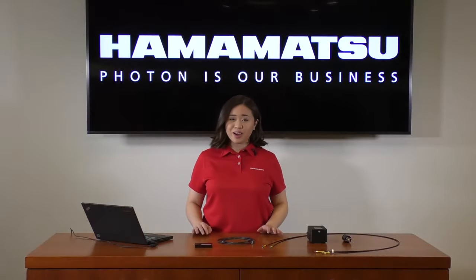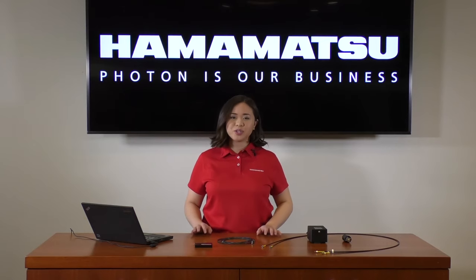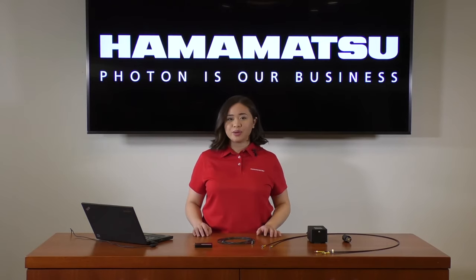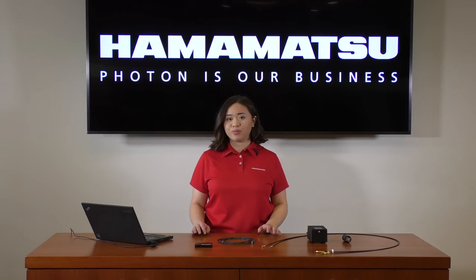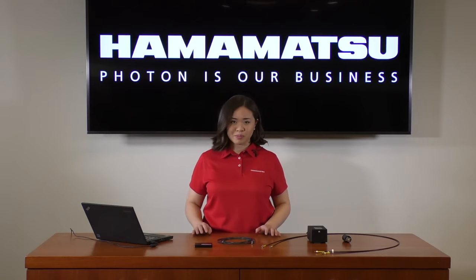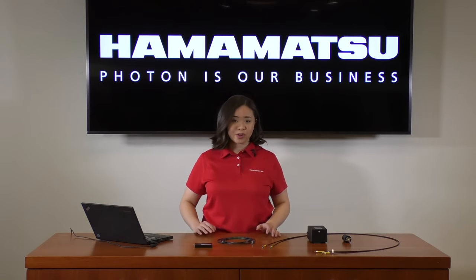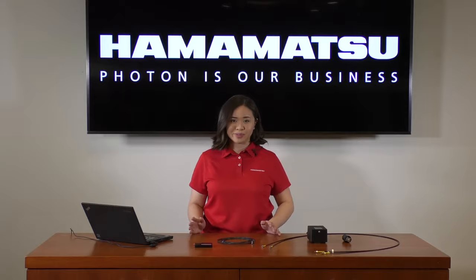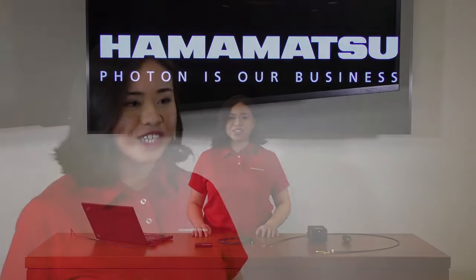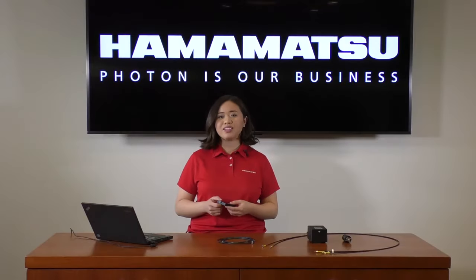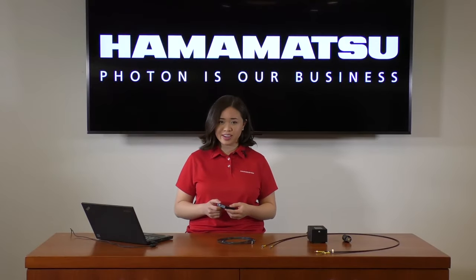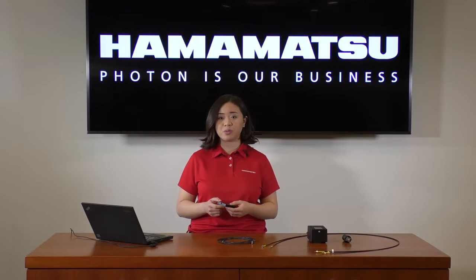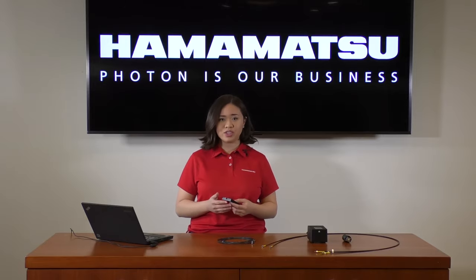Housed in a compact and thin case, this spectrometer contains the optics, image sensor, and driver circuit necessary to perform various portable spectroscopic measurements for colorimetry applications for example. Each of these components are manufactured by Hamamatsu Photonics. This allows for us to have an understanding and control of the production of these parts from start to finish, resulting in high performance, high reliability, reproducible portable devices.